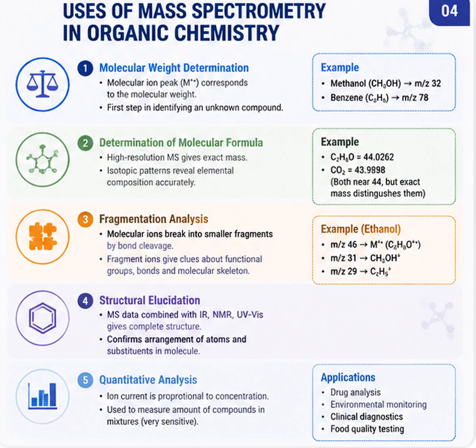So, mass spectrometry is not just a machine for measuring mass. It is a powerful tool that helps scientists identify unknown compounds and understand their molecular structure clearly.